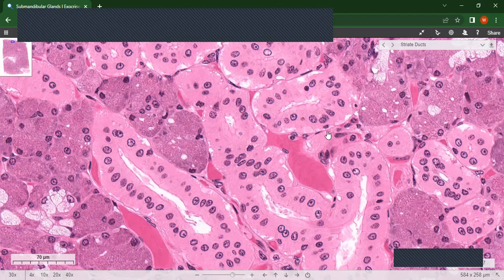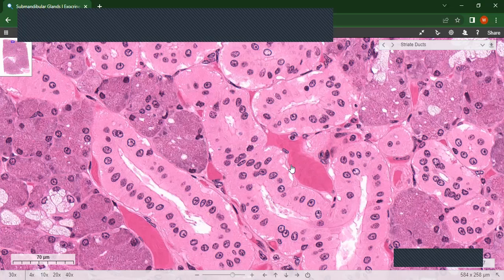Let's identify if you can see a capillary here. Yes — like this. This is a capillary.